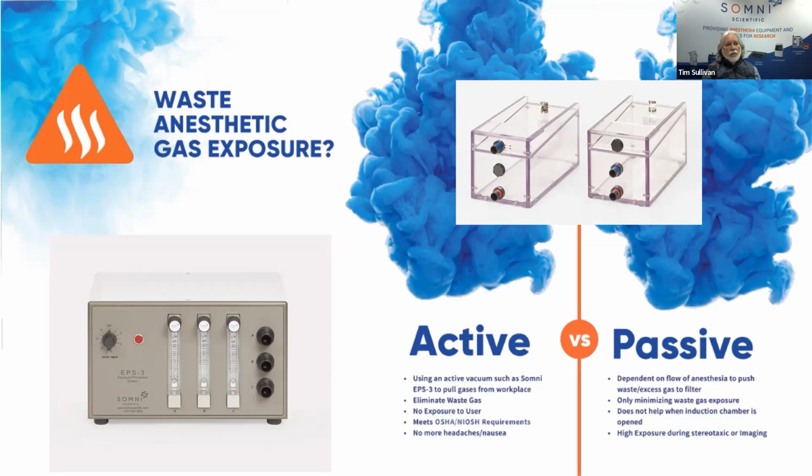This creates back pressure, forcing the anesthetic gas out the top of the chamber as soon as you open it, exposing the user.